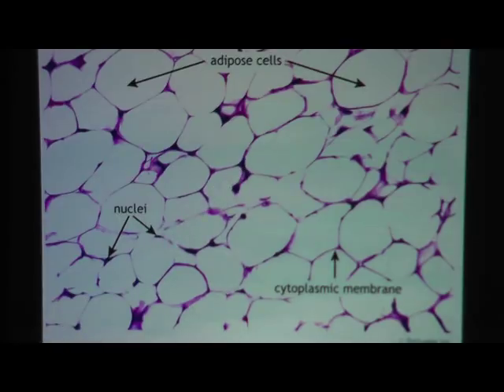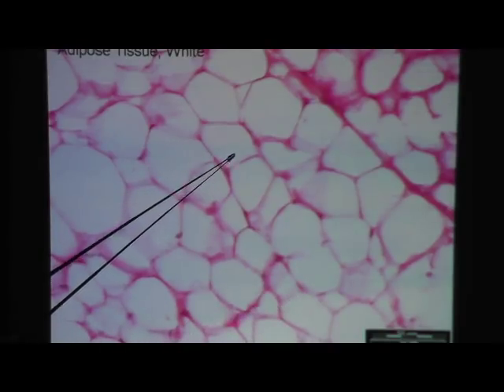Here's another look at adipocytes in fat tissue. Each one of these is an adipocyte. Every once in a while you might see a possible nucleus, but remember, the nucleus is hard to find in adipose. In another view, you might spot a little bit of nucleus here and there, but you can definitely see the plasma membrane quite clearly.